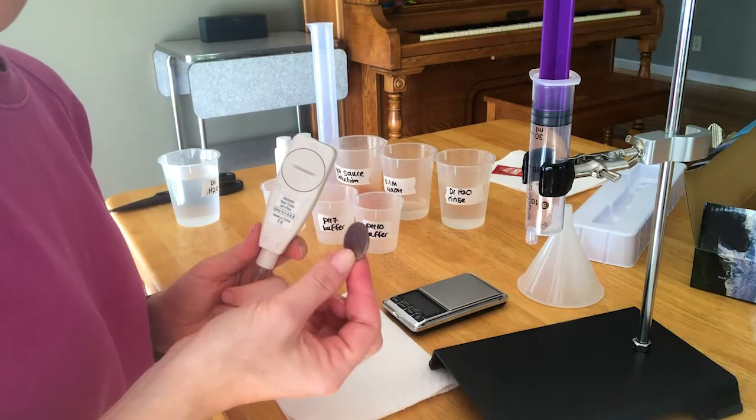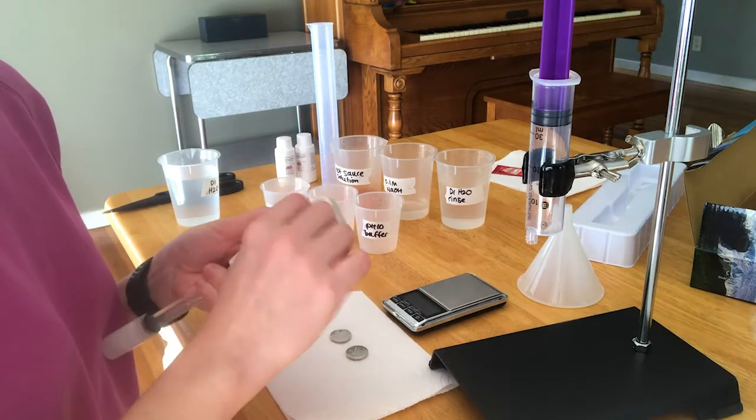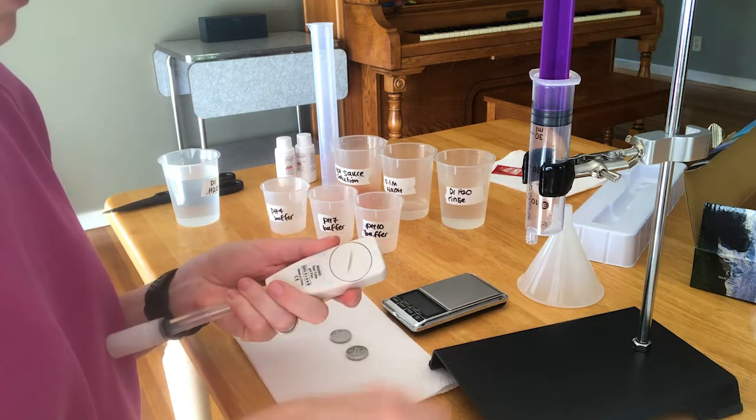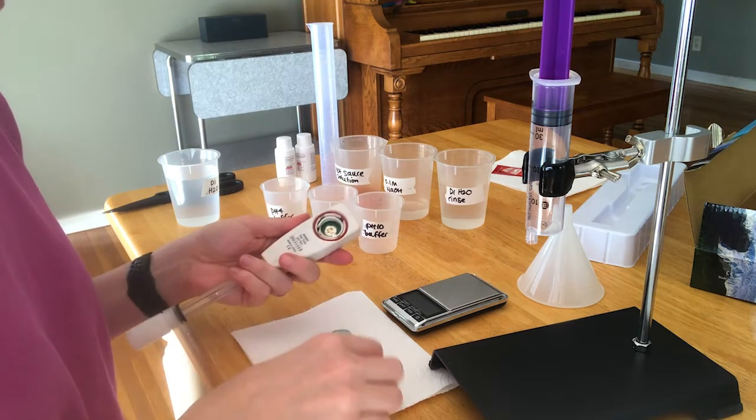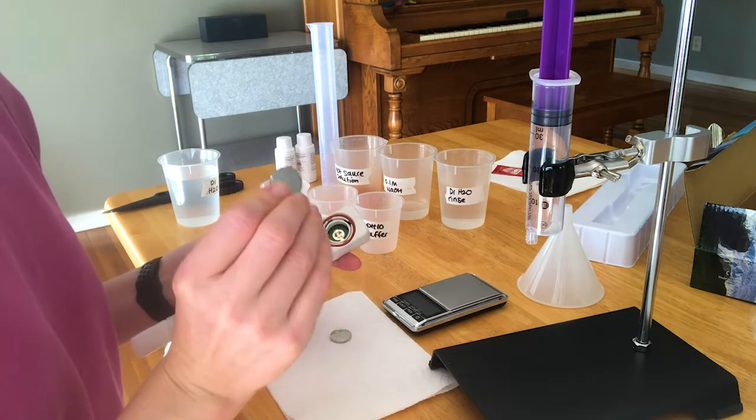You have to calibrate the pH meter before you start using it, so you're going to need a quarter to open the back. Just twist it to the right. You're going to see there's this little rubber seal, this o-ring. Make sure that doesn't fall out.